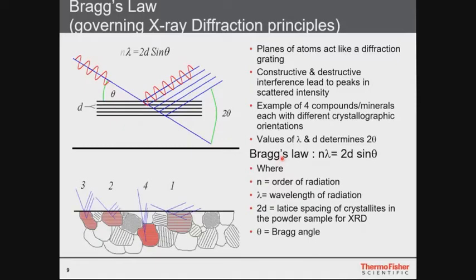If we now go to more energetic radiation with smaller wavelengths, we can reduce the size of the grating, which acts as a diffractant. And in the case of X-rays, we are going down to the regime of atoms. You now think of a three-dimensional periodically ordered arrangement of atoms.